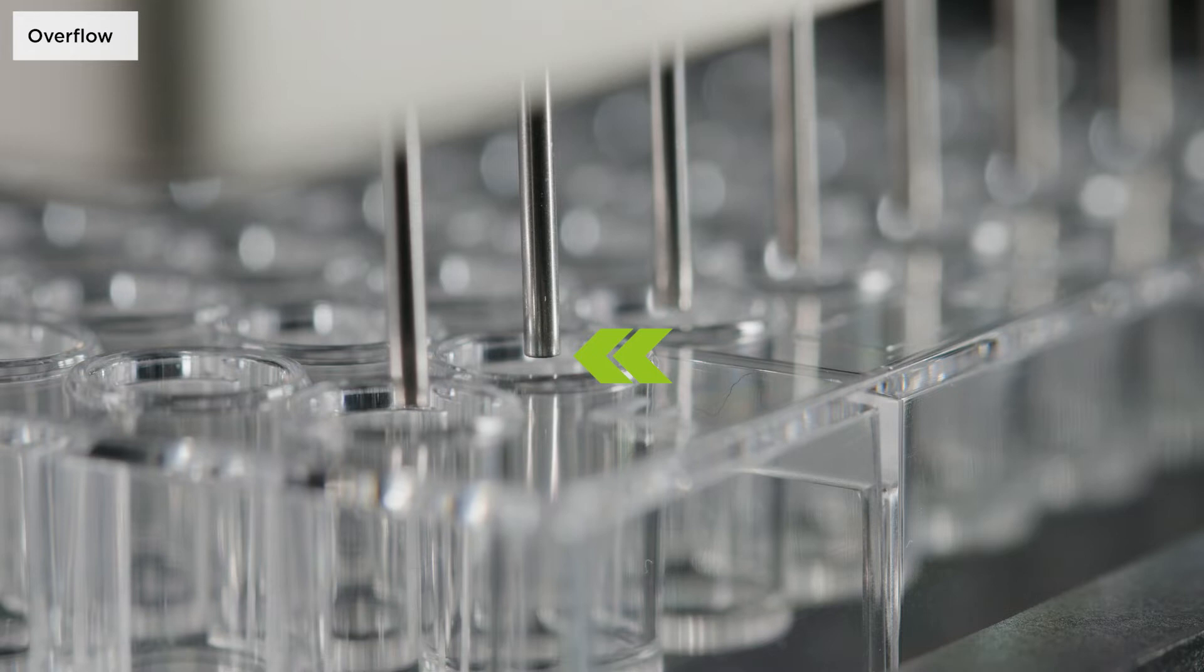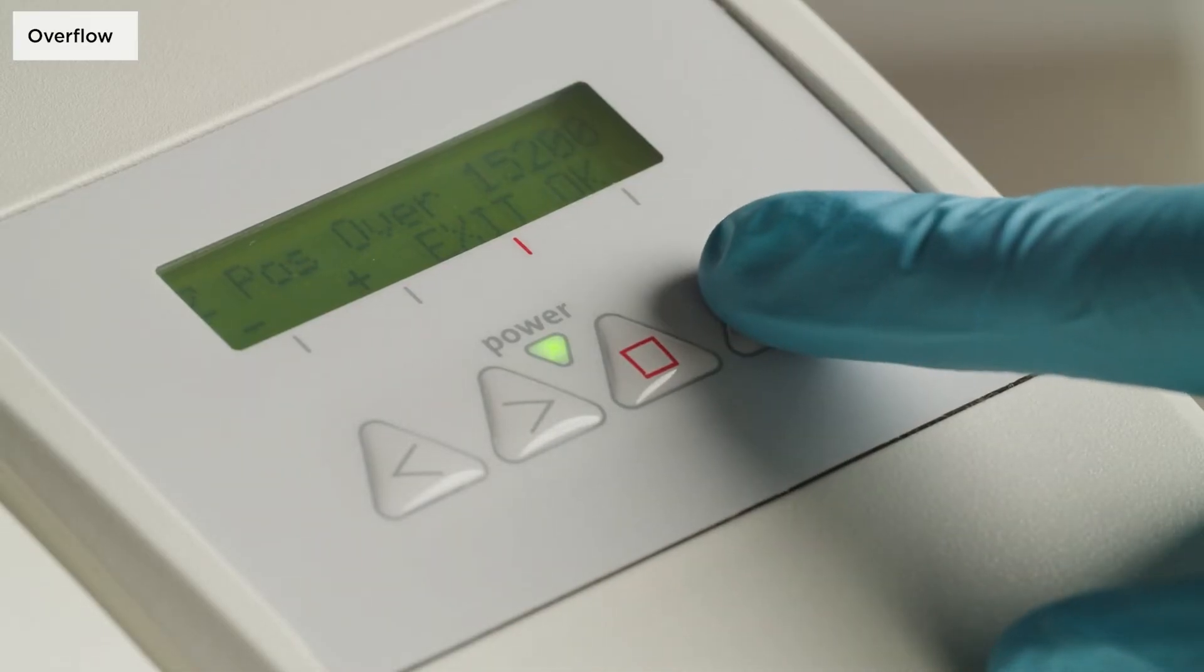The typical wash head position for overflow washing sets the aspiration needles close to the rim of the well. Once the position is correct, confirm with OK.